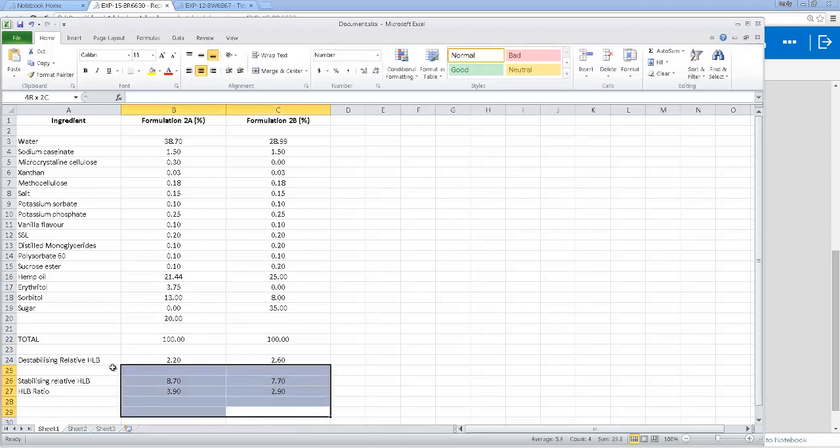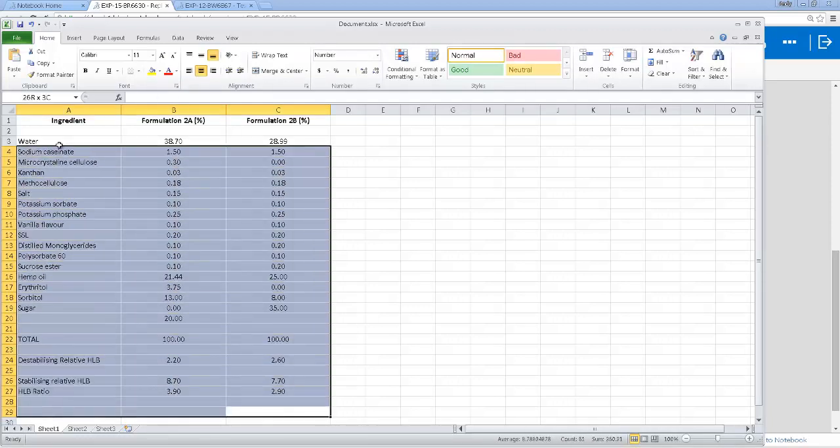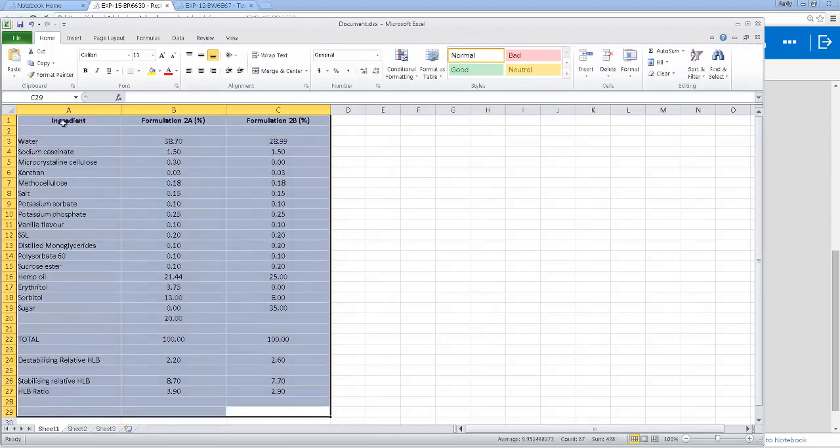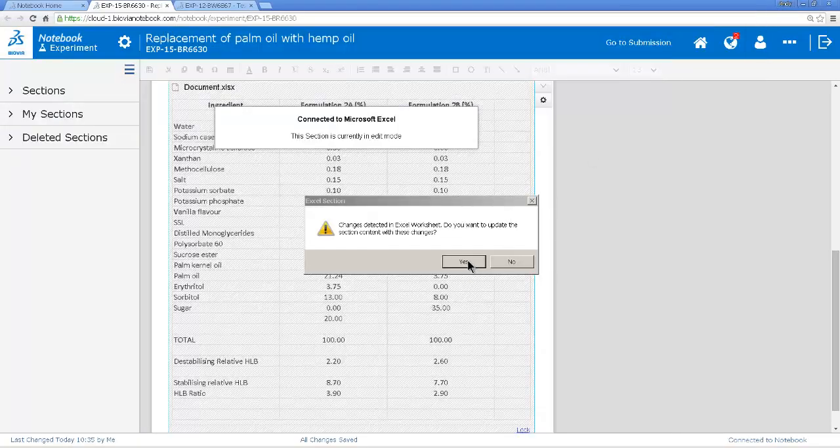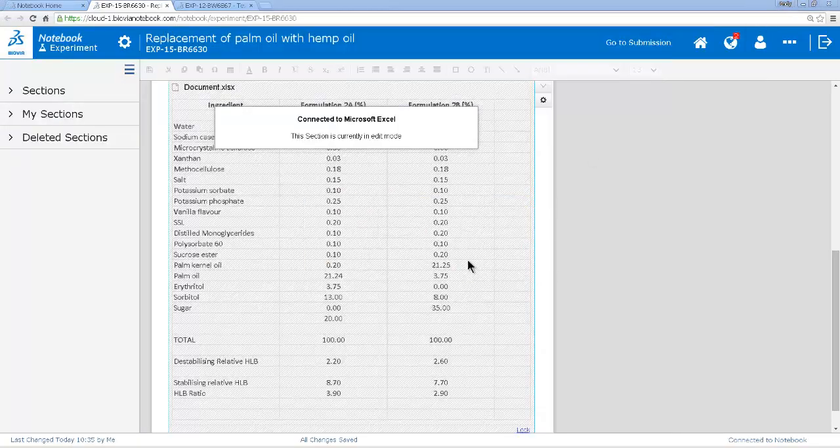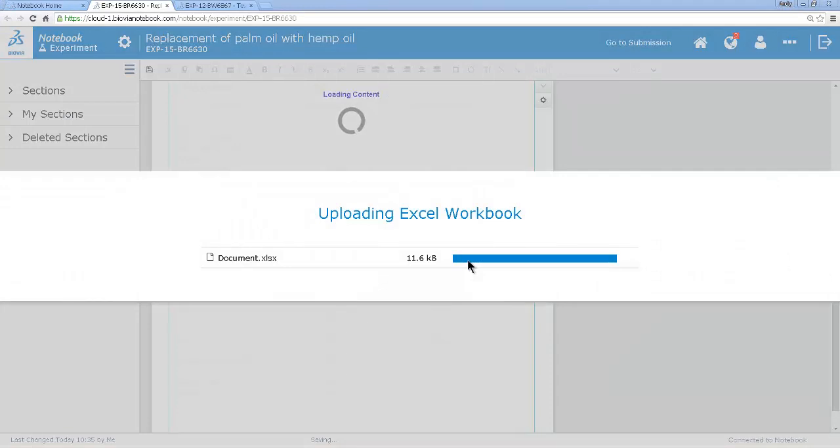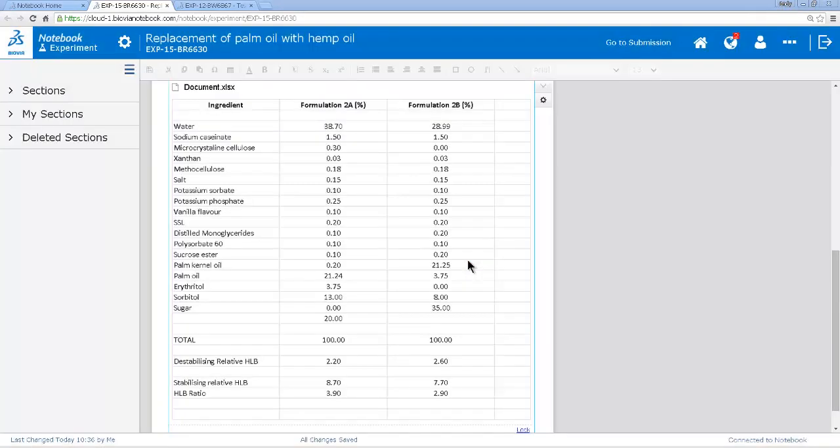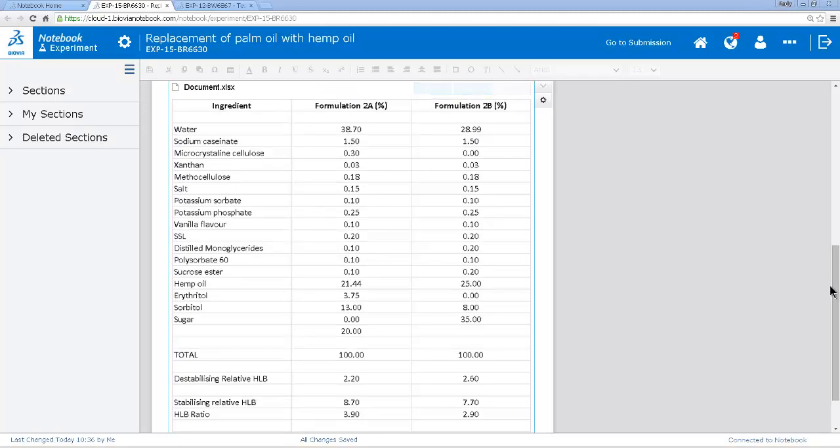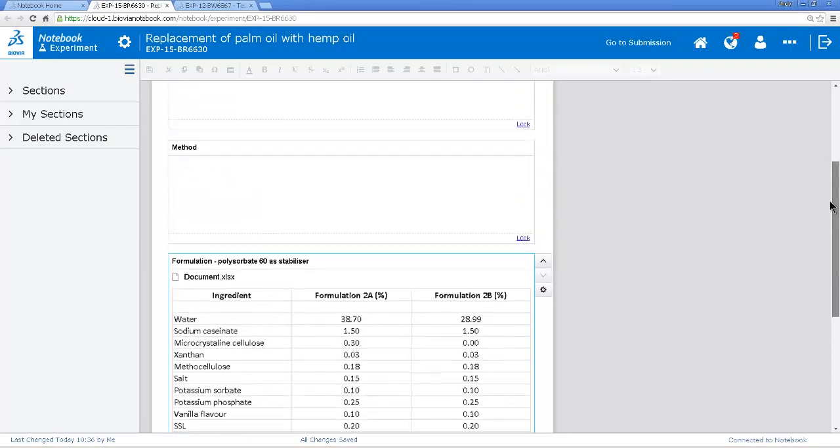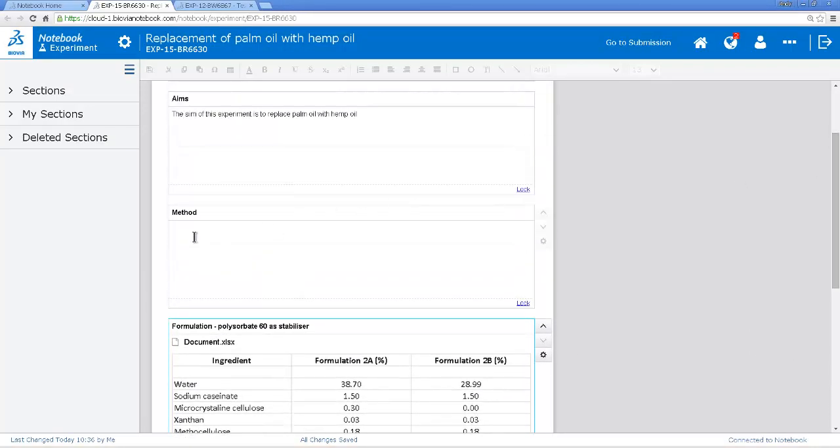I then select the cells that are going to go back into the experiment. And then I close Excel. That modified Excel sheet then comes back into my experiment. I would then add additional information to this experiment. I would add my method, etc.